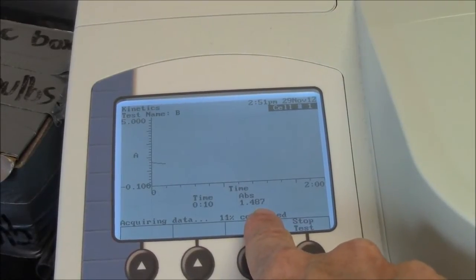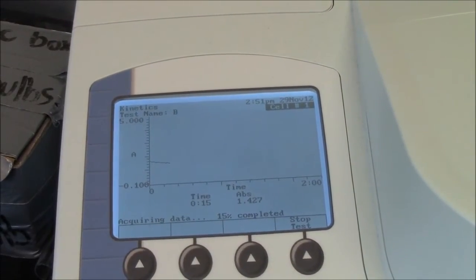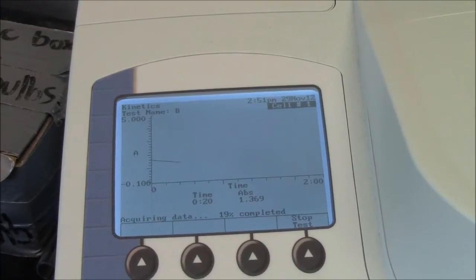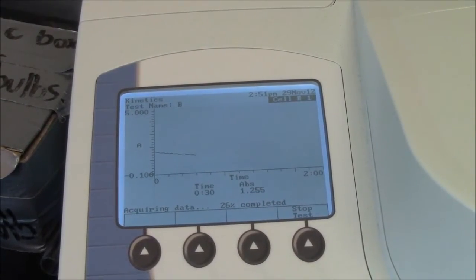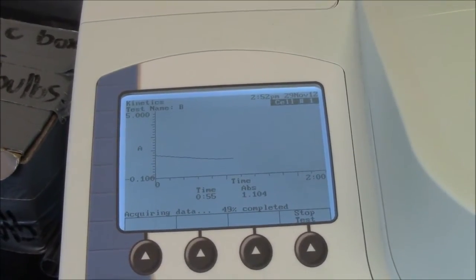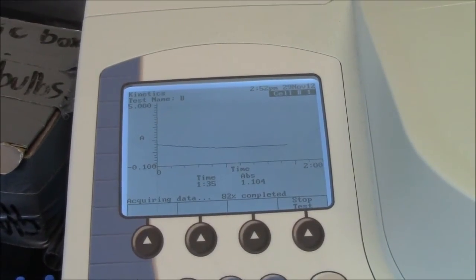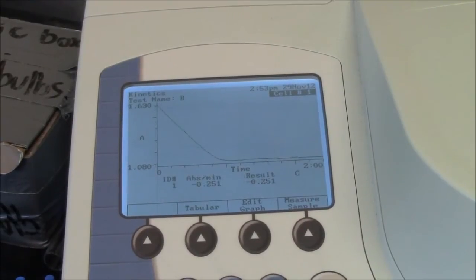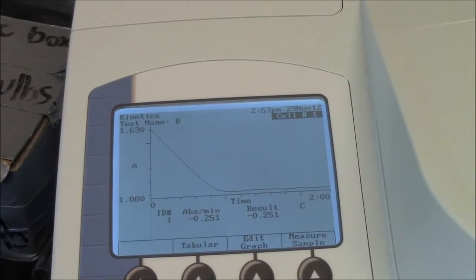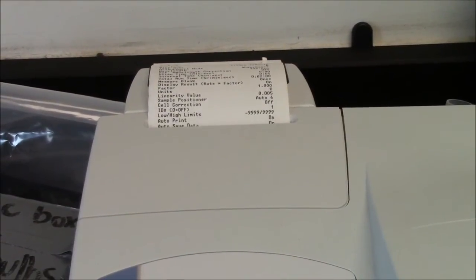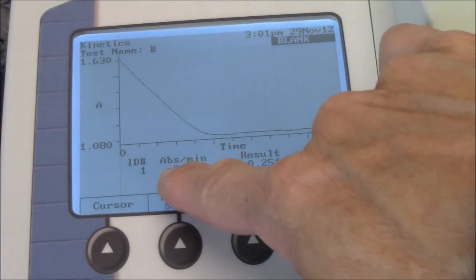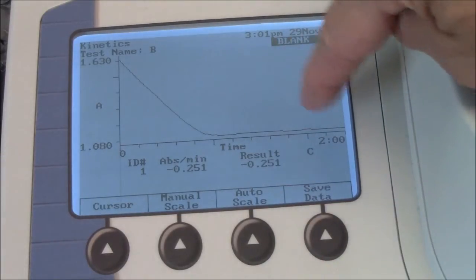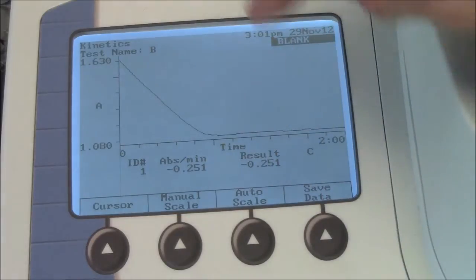The absorbance is changing with time, which is being plotted on this graph. Since it's going to run for 2 minutes at 5 second intervals, that should be 24 data points, which is plenty to get a nice linear rate. The graph shows the progress of the reaction. It is set to auto print, so out comes the printout. It has provided a rate, but that rate takes the average over the entire time period. You can see that the initial rate is steep, and then it bottoms out when all the ampicillin is destroyed.